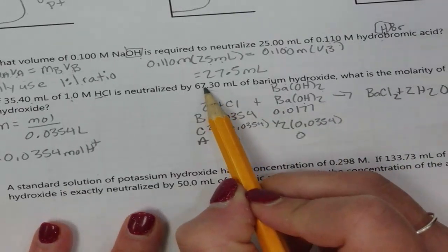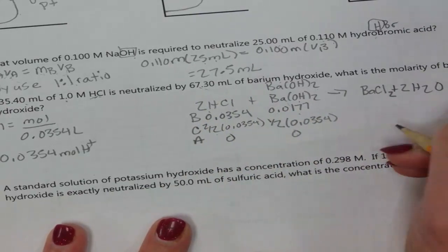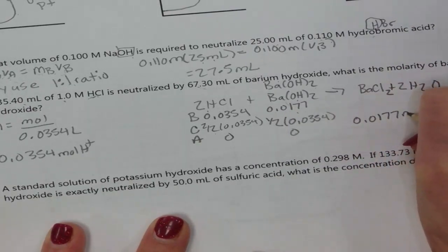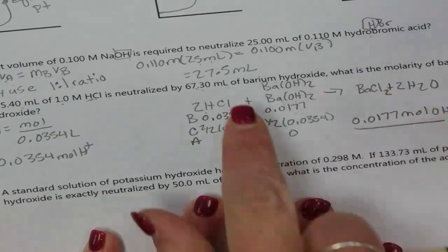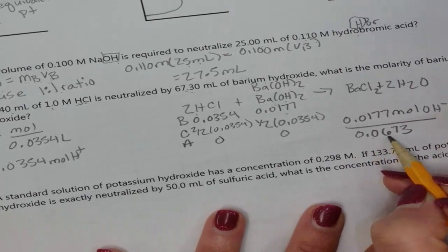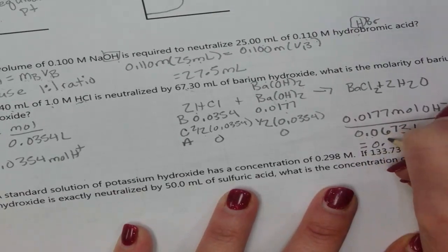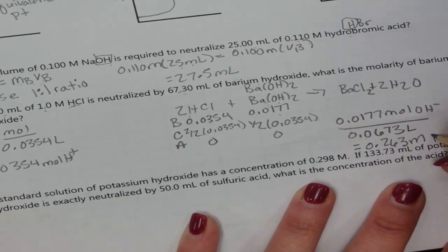It took 67.3 milliliters, and I had 0.0177 moles of hydroxide for a value of 0.0673 liters. So that means that I had a concentration of base of 0.263 molar.